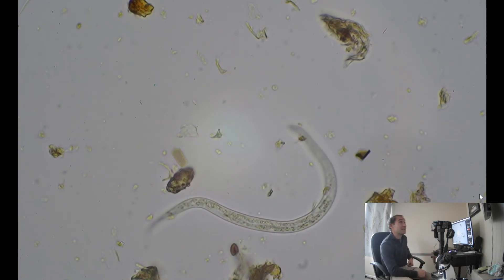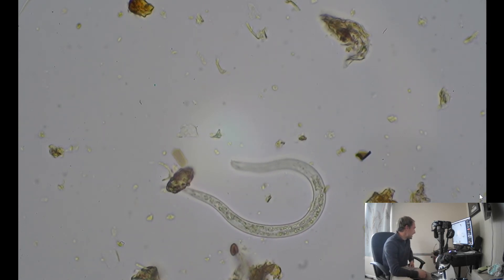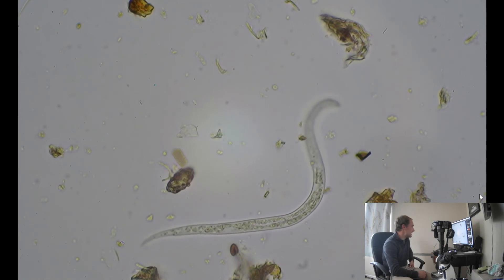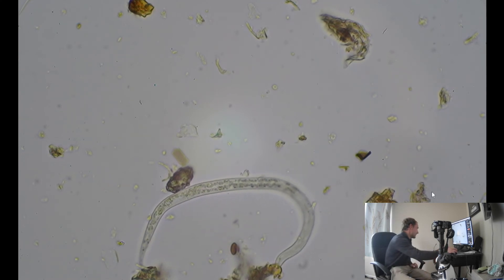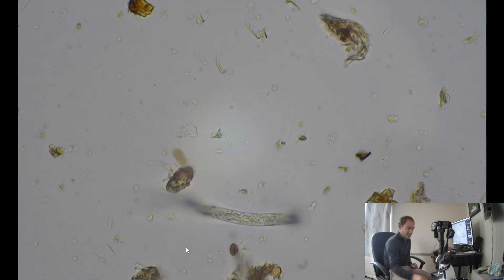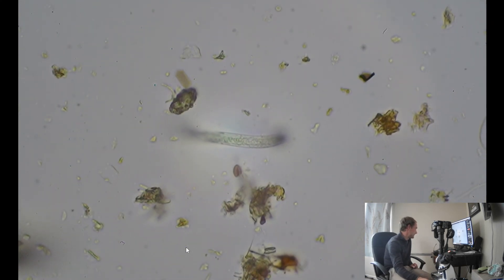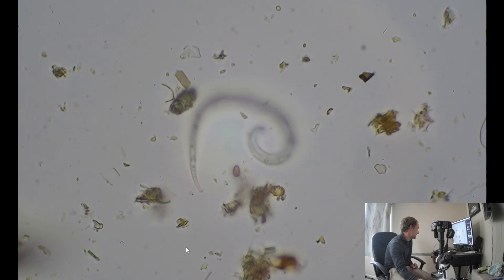All right, well there's a nice shot of a nematode. I haven't seen many of them, but it's getting warmer here in Massachusetts. Actually, I think right there we have a fungal spore, a little football-shaped one. Yeah, a lot of good signs.